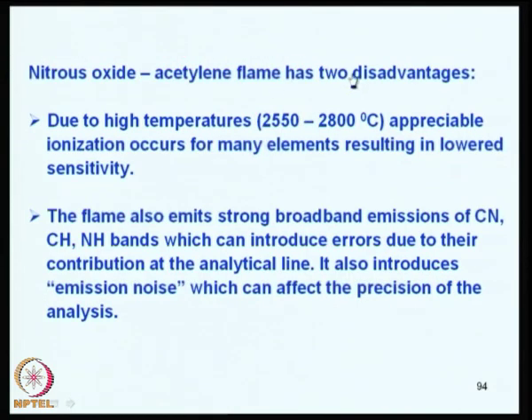So, is it good? Yes, basically it is good, but even the nitrous oxide acetylene flame has two disadvantages. One is that due to the high temperature employed, of the order of about 2500 to 2800 degree centigrade, appreciable ionization occurs, and to that extent the production of atoms decreases. So, your sensitivity decreases because of the appreciable ionization.